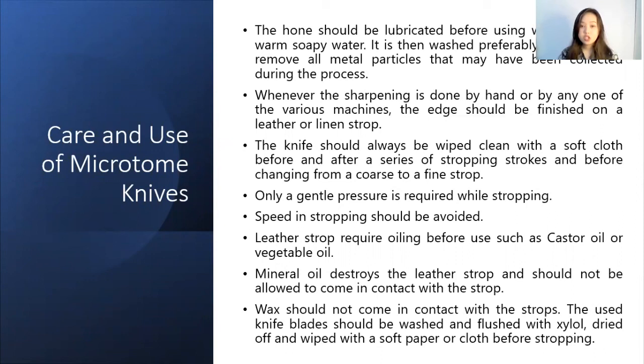However, treated strops should not be used for at least 24 to 48 hours after treatment. And the 11th is that mineral oil destroys the leather strop and should not be allowed to come in contact with the strop. One drop of mineral oil can damage the polish of that area and permanently produce a blemish on it. And the last one is that wax should not come in contact with the strops.